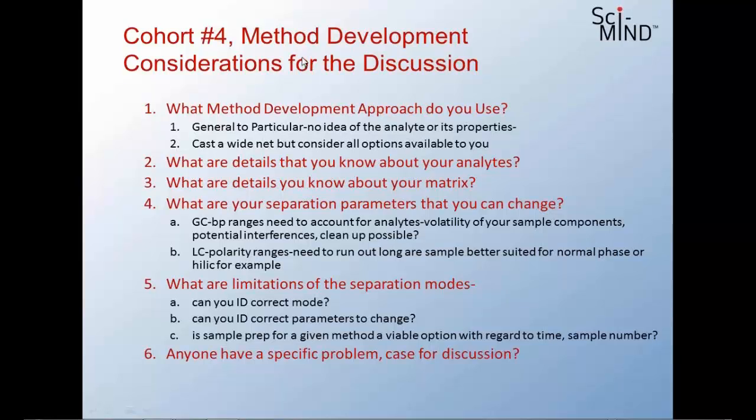Well, in the discussions, there were a couple of discussions about subambient cooling, where they were going to minus 50, for example. In my work when I was doing volatiles analysis, we started out at about minus 25, so we could get those low molecular weight halocarbons like dichloromethane, which up until then were just written off as non-doable.